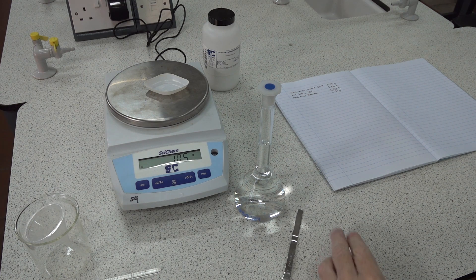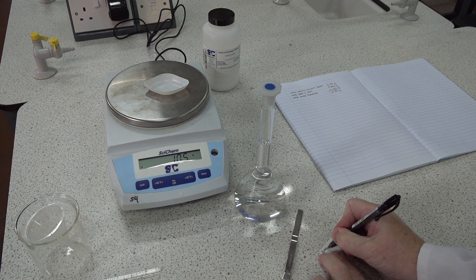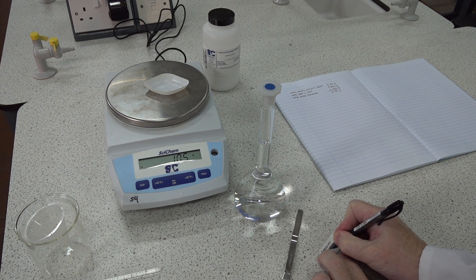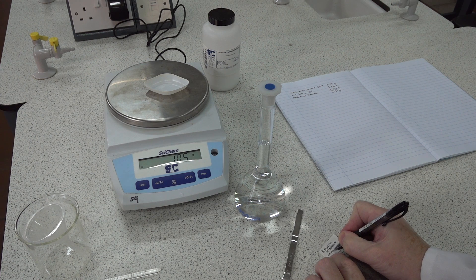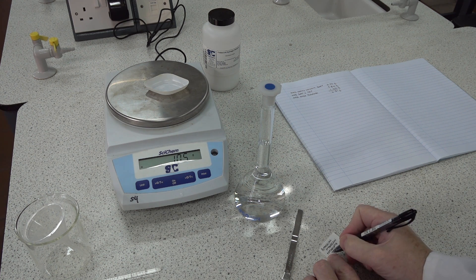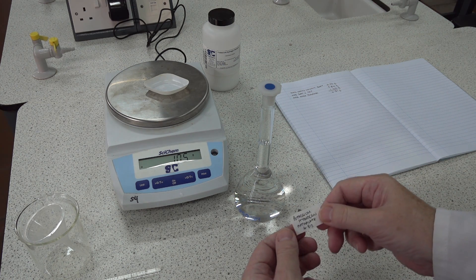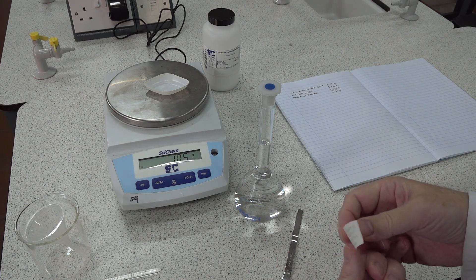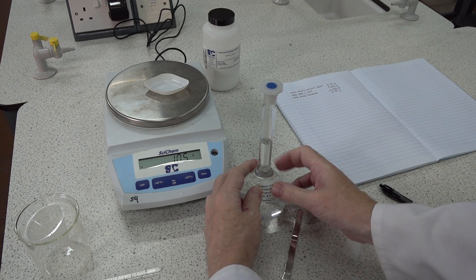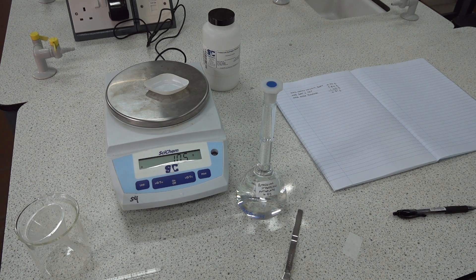All that remains is to write a label on the bottle. We've got 4.81 grams in the solution and we need to determine the concentration. Students would also initial the label to identify it. Preparing a standard solution of potassium hydrogen phthalate is now complete.